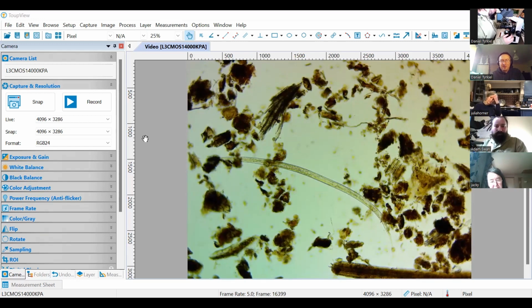But if you're only seeing 3, like in this, for instance, and then you put another drop on the slide and you see none, and you see none, and then you have another drop and you see 8, that's now a statistically very, very different number. And so then you basically look at the averages, and you look at how far from the average are those maximums and minimums. That gives you the confidence in the actual values.